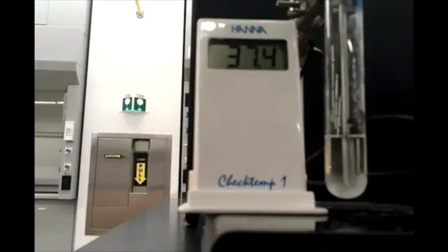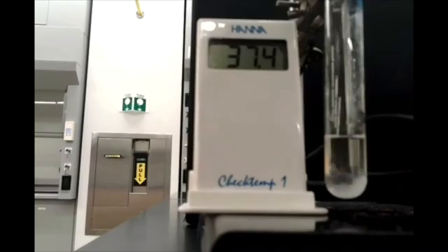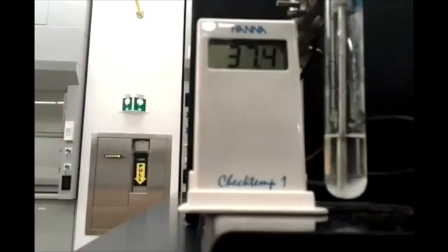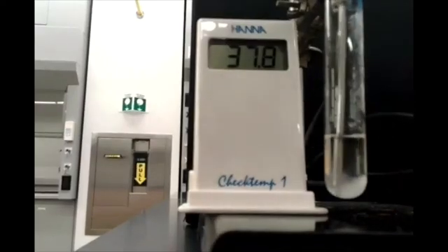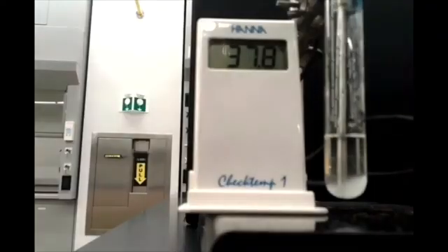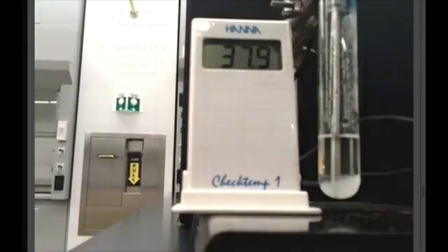Alrighty, there we go. So make a note of the temperature at which these crystals first appeared. Feel free to rewind the video a little bit to get that temperature. But you can see, there we go. We have crystals crashing out of solution, and that tells us that our solution is now saturated.